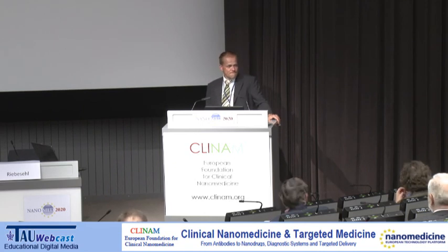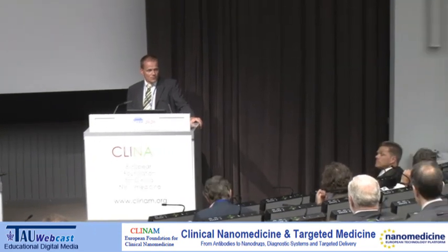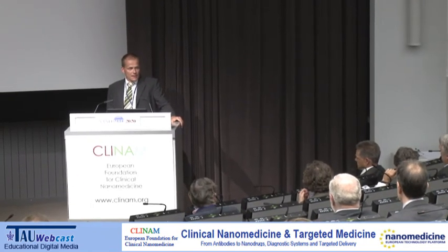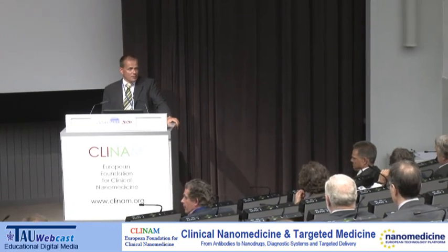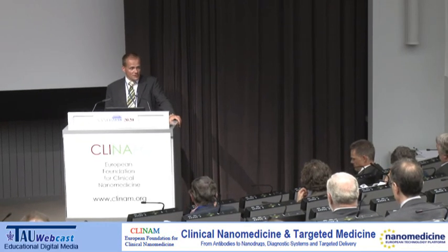Very last question. There was a huge difference in the Tmax in your example. 8 hours versus 24 hours for the SEDDS. Do you have an explanation for this? Yeah, perhaps one explanation may be still the dissolution kinetics, because in a SEDDS formulation the drug is more or less dissolved in the system. That's a clear advantage, of course.